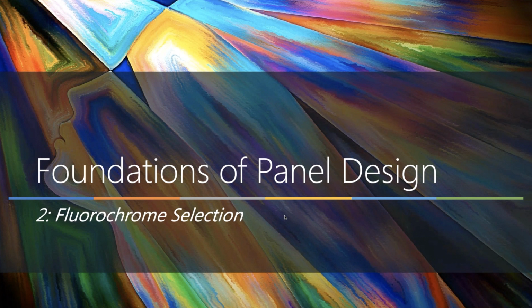Okay, what can we help you with, and what do we have a lot of information on that we can provide to you as a starting point in terms of the panel design is the fluorochrome selection.